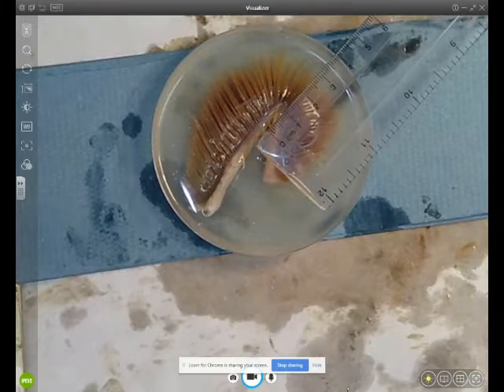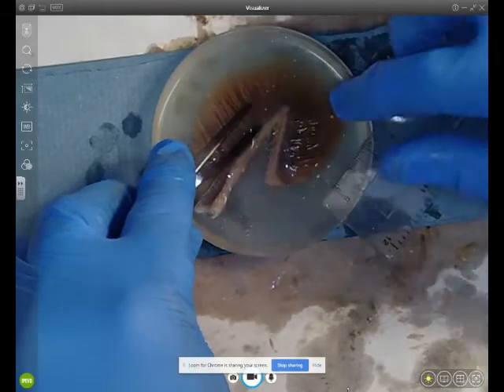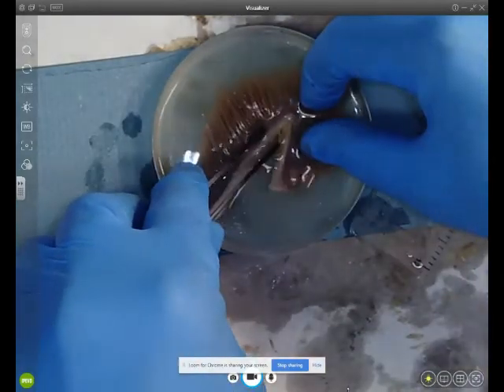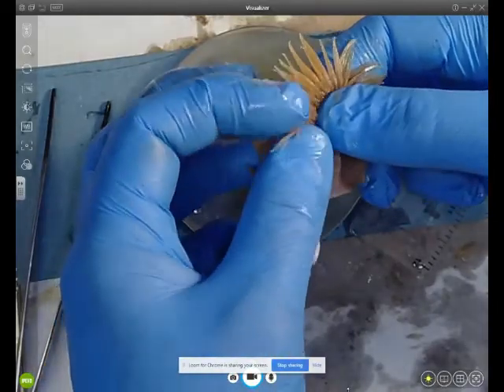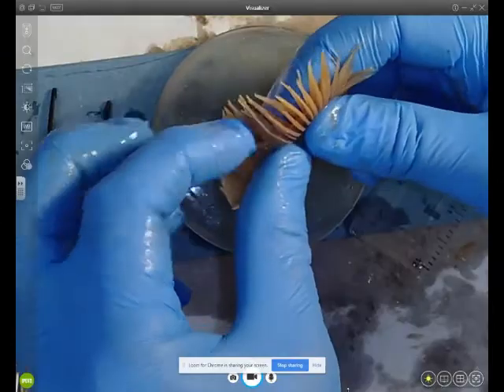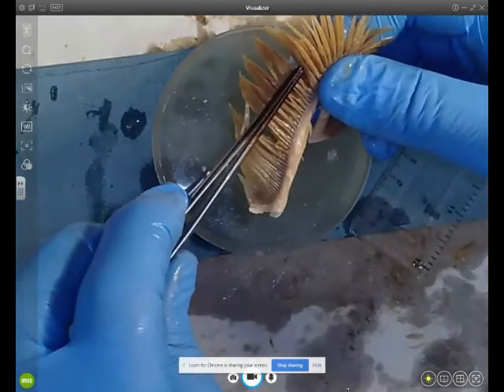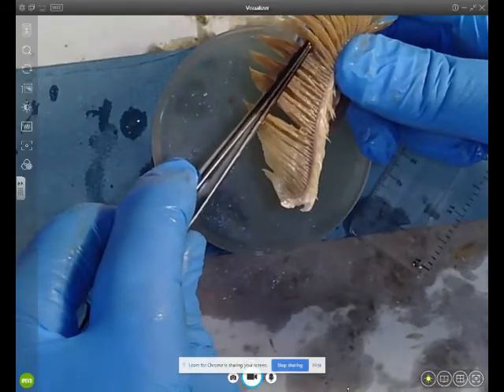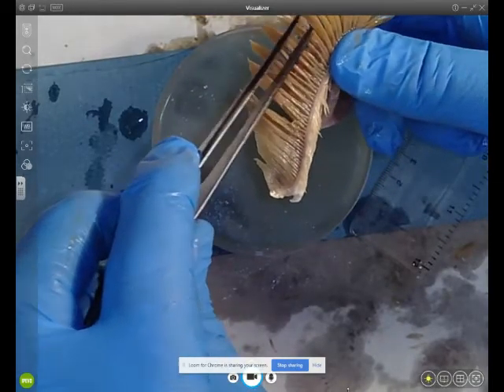I'm going to try to work out how many gill filaments there are in 10 millimeters by counting each one. They're in double rows and they're extremely thin, so it's quite difficult to count them, but you can make a good approximation of the number of gill filaments.